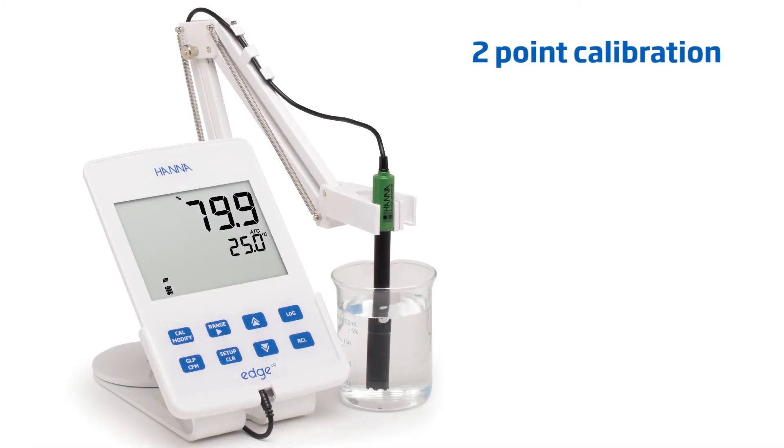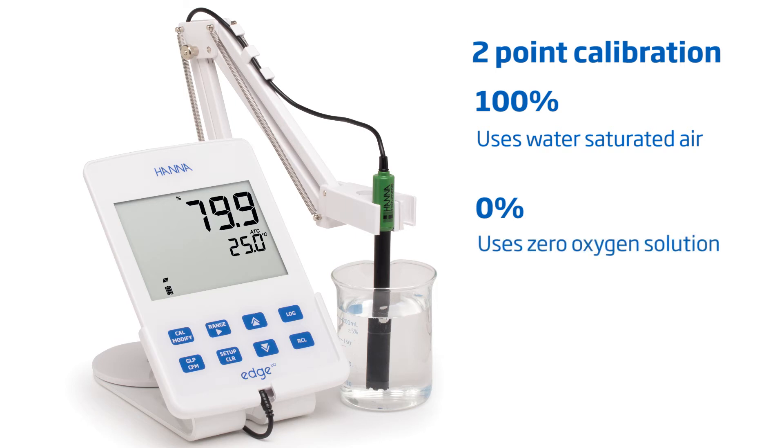Edge meters are capable of calibrating at up to 2 points: 100% and 0%. The 100% point uses water-saturated air, and the 0% point uses zero oxygen solution. We'll demonstrate both methods with a 2-point calibration.